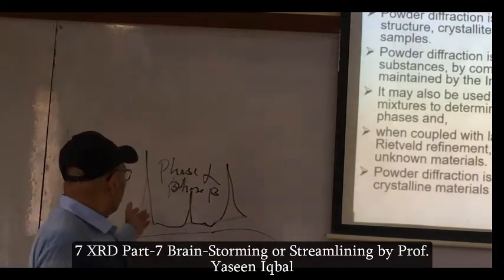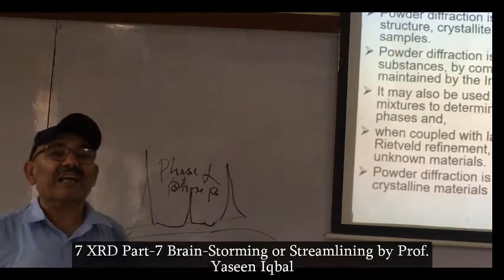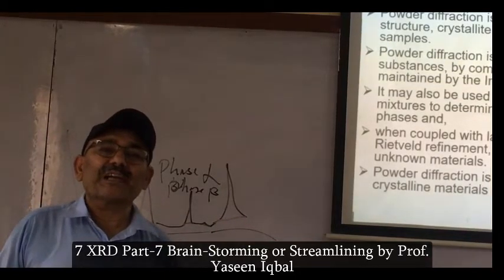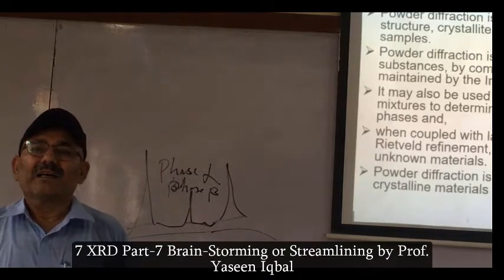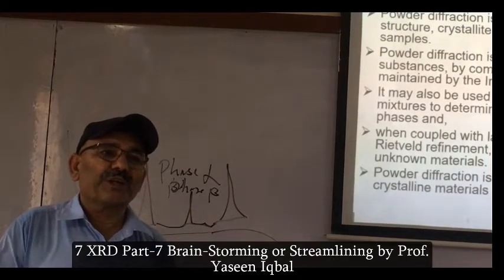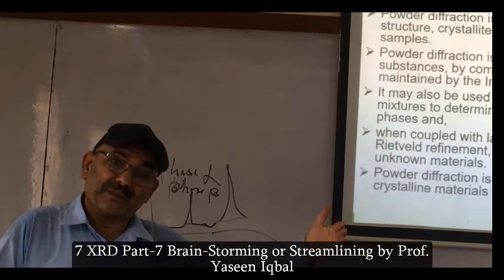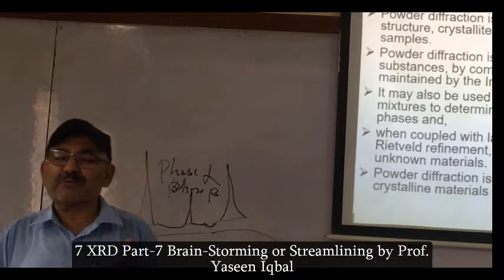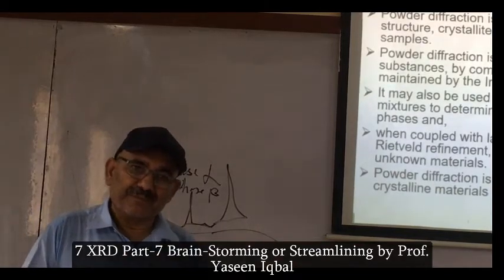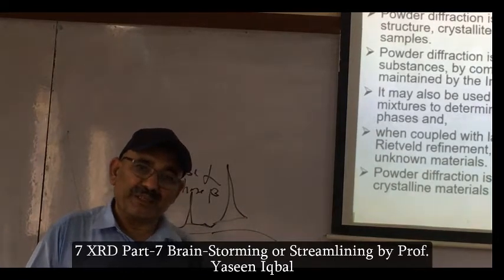But when you measure the area like this or like that, it is the raw data. The raw data means how many filters did you use? Someone is using more filters, his data is more refined. Some people are using very slow scanning speed, and some people are using very fast scanning speed.